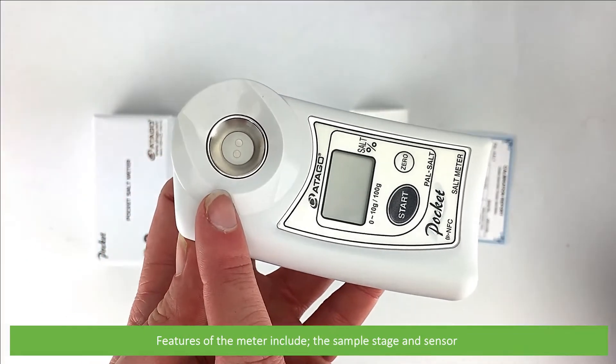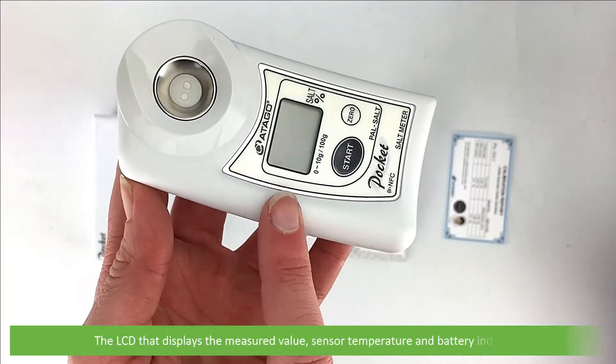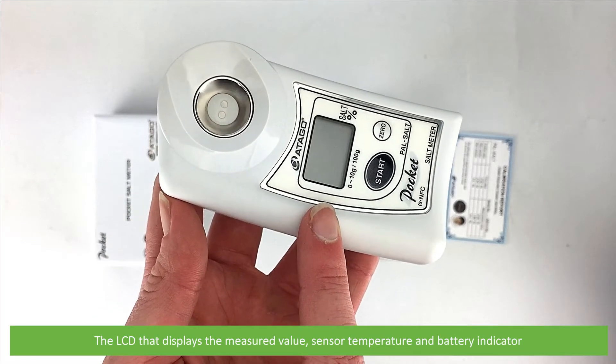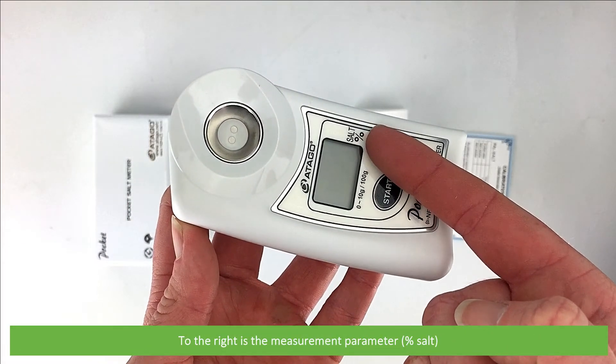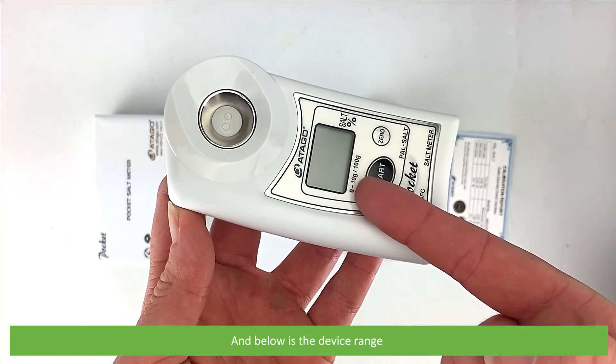Features of the meter include the sample stage and sensor, and the LCD that displays the measured value, sensor temperature, and the battery indicator. To the right is the measurement parameter — that's percentage salt — and below is the device range.